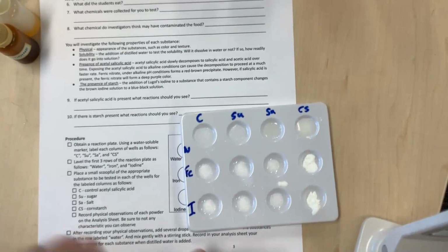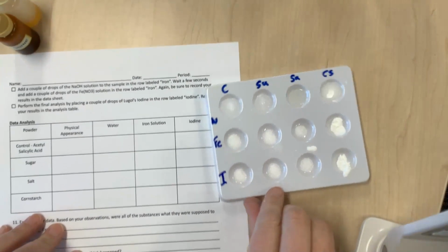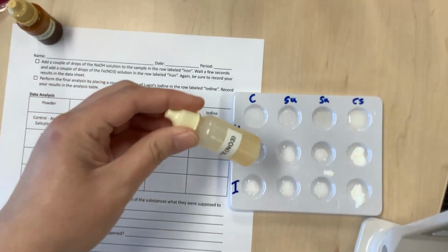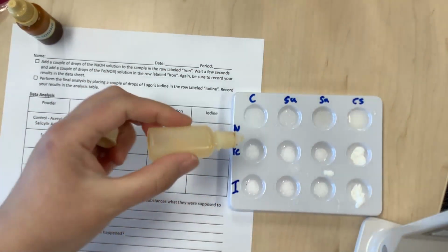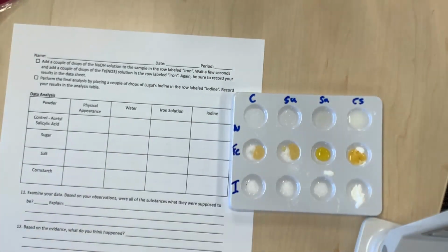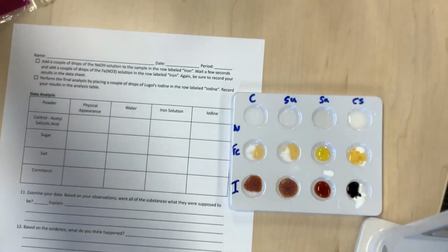So the idea here, I'm going to flip this for a second, is physical appearance. I would have already filled that in. How did my control react with water? I'm going to explain it. Then I'm going to put the ferric, basically the iron solution. It will show you what the reactions are supposed to be when you read through the directions.